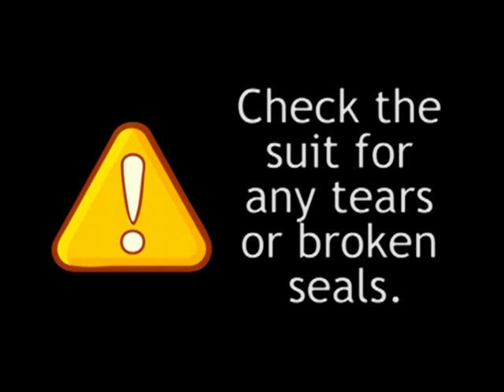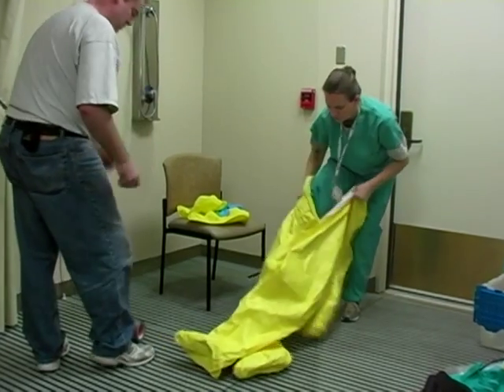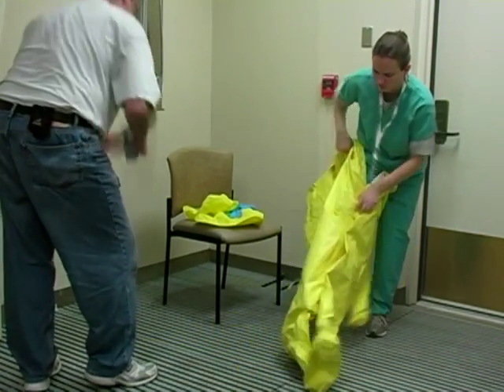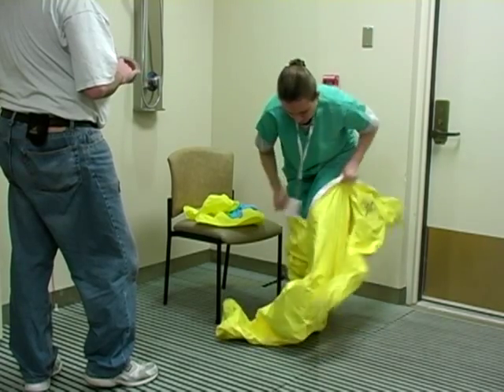Begin by checking the suit for any tears or broken seals. When you are happy that the equipment is in satisfactory condition, you can begin to apply the suit and boots.